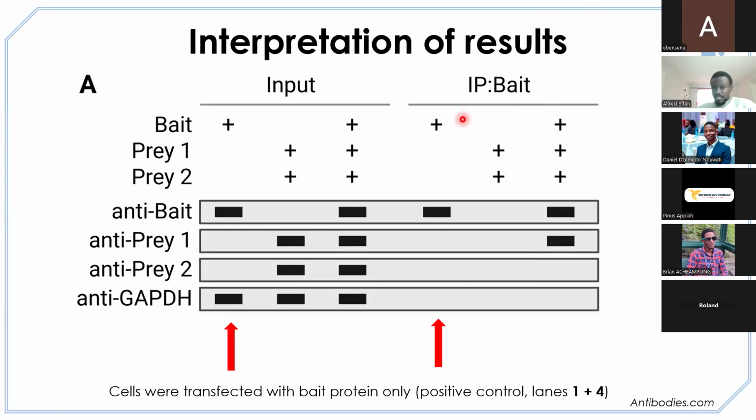So that is the result that we are seeing at the end here. The whole of this, they performed the Western blot on that side, which is the eluate, when they eluted the sample. So now, over here too, they had only the bait. So your cell whereby we had only the bait, it's there. When you stain for it, we should see it. A cell whereby they transfected it with this, when you do the washing, when you do all your steps, we should see that, yes, indeed, the bait is present. So that's what we are seeing here.